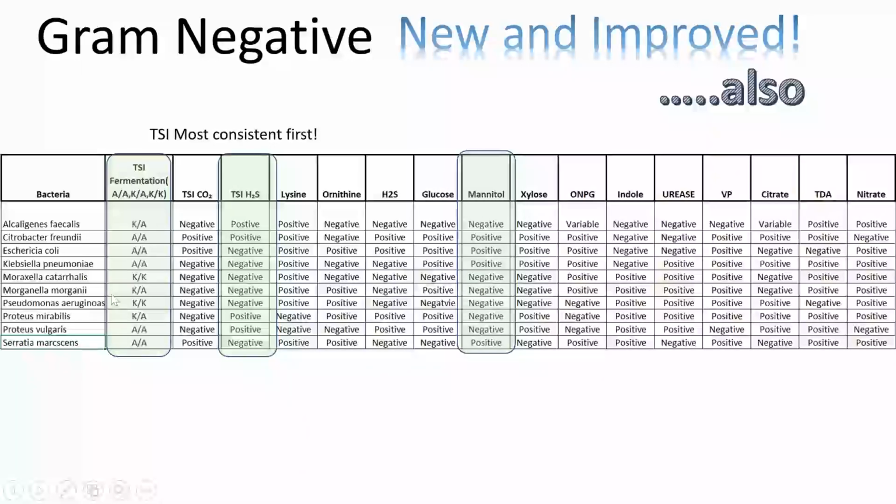So that's another reinforcing clue. By the way, if you are tripped up about the Pseudomonas and you're like, hey, there's some black stuff, I'm not sure, you do have an H2S test that works really well in your test strips, so just make use of that. Pseudomonas aeruginosa shows up negative on that H2S there. Basically, you just have to work your way through and try to figure out the best one.